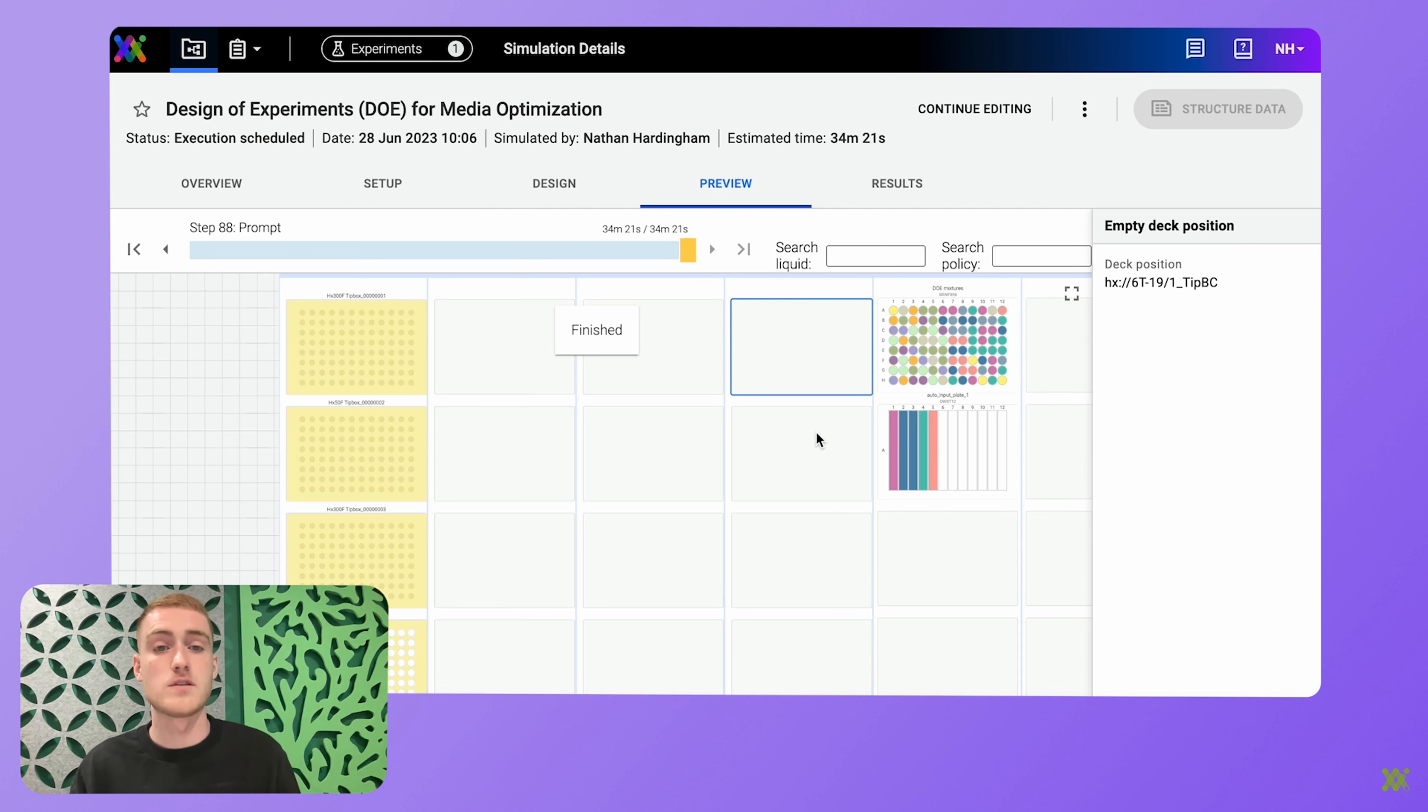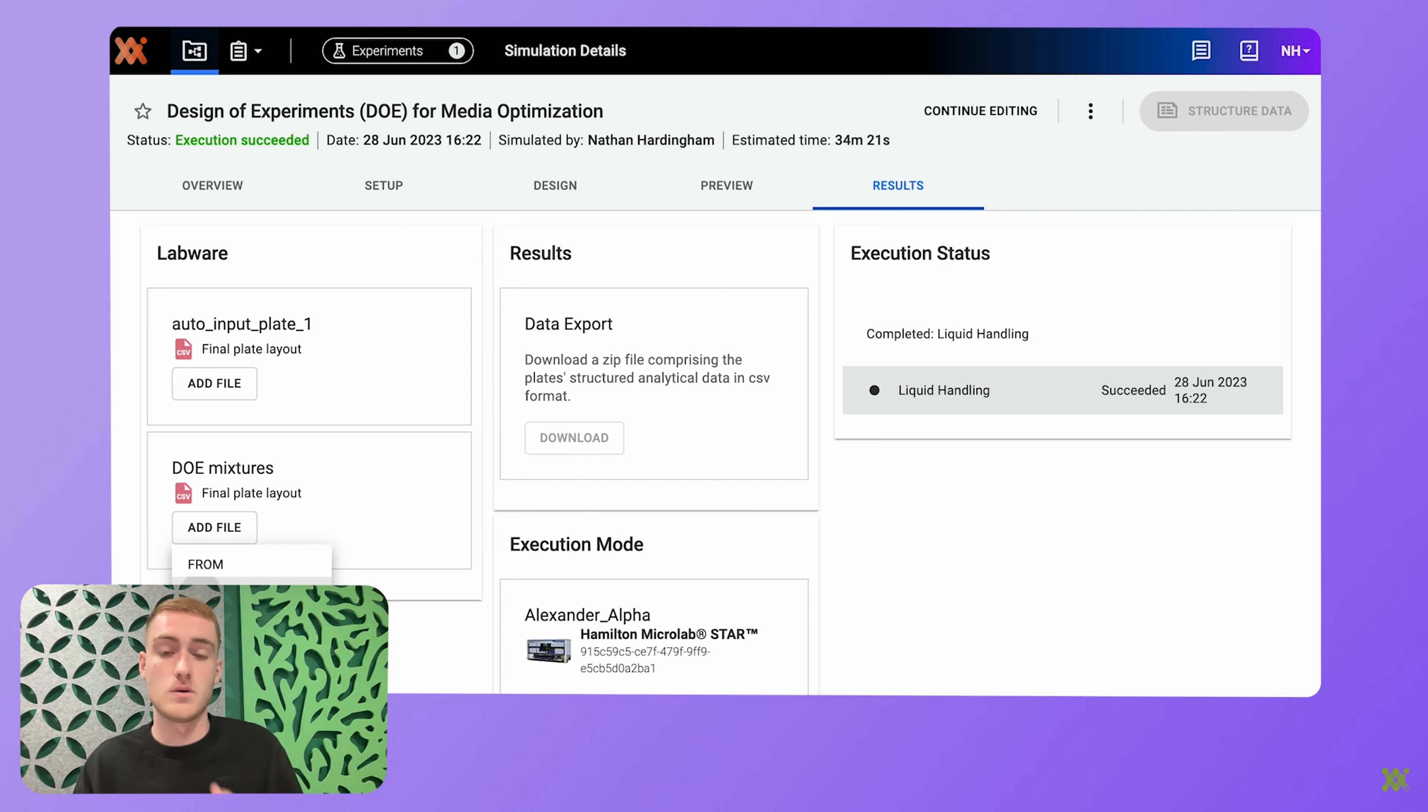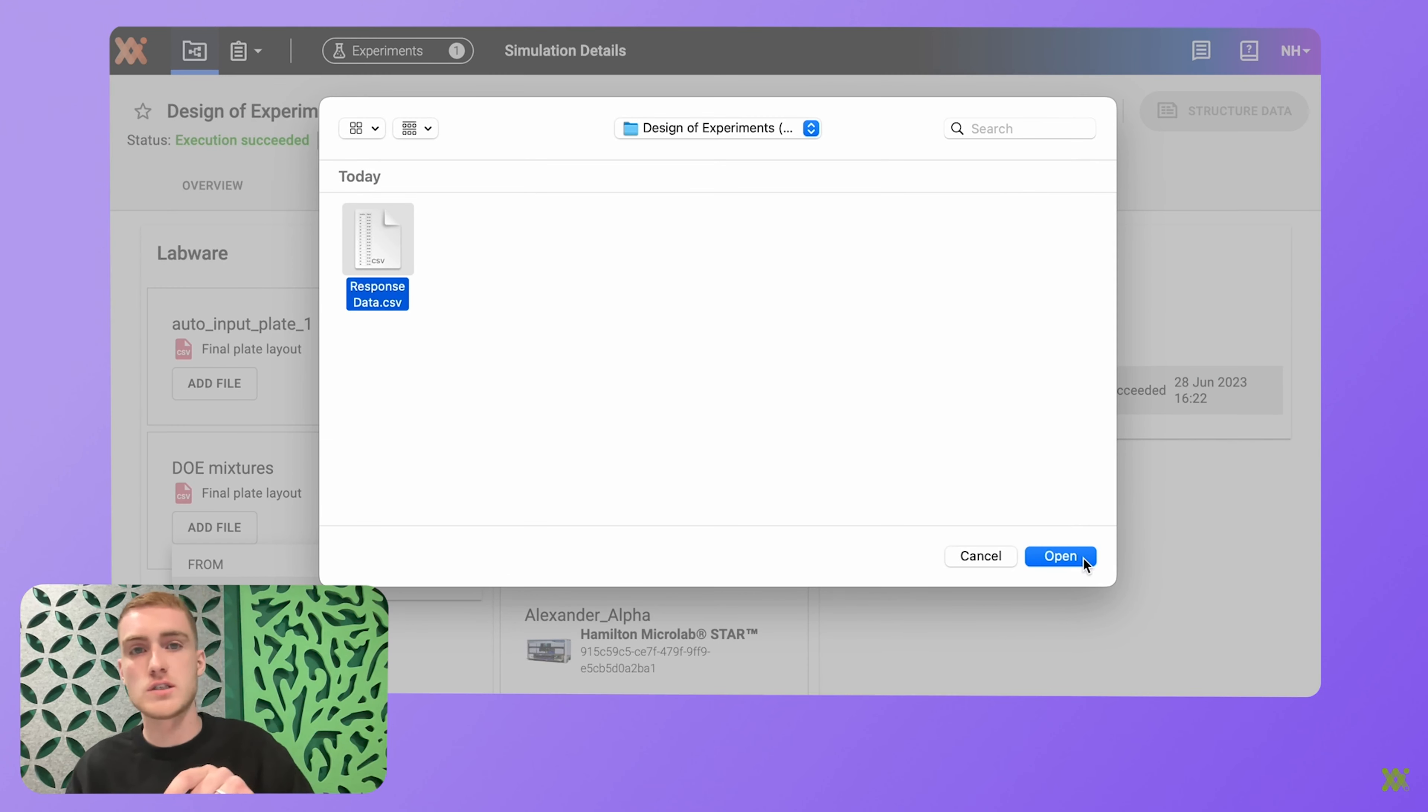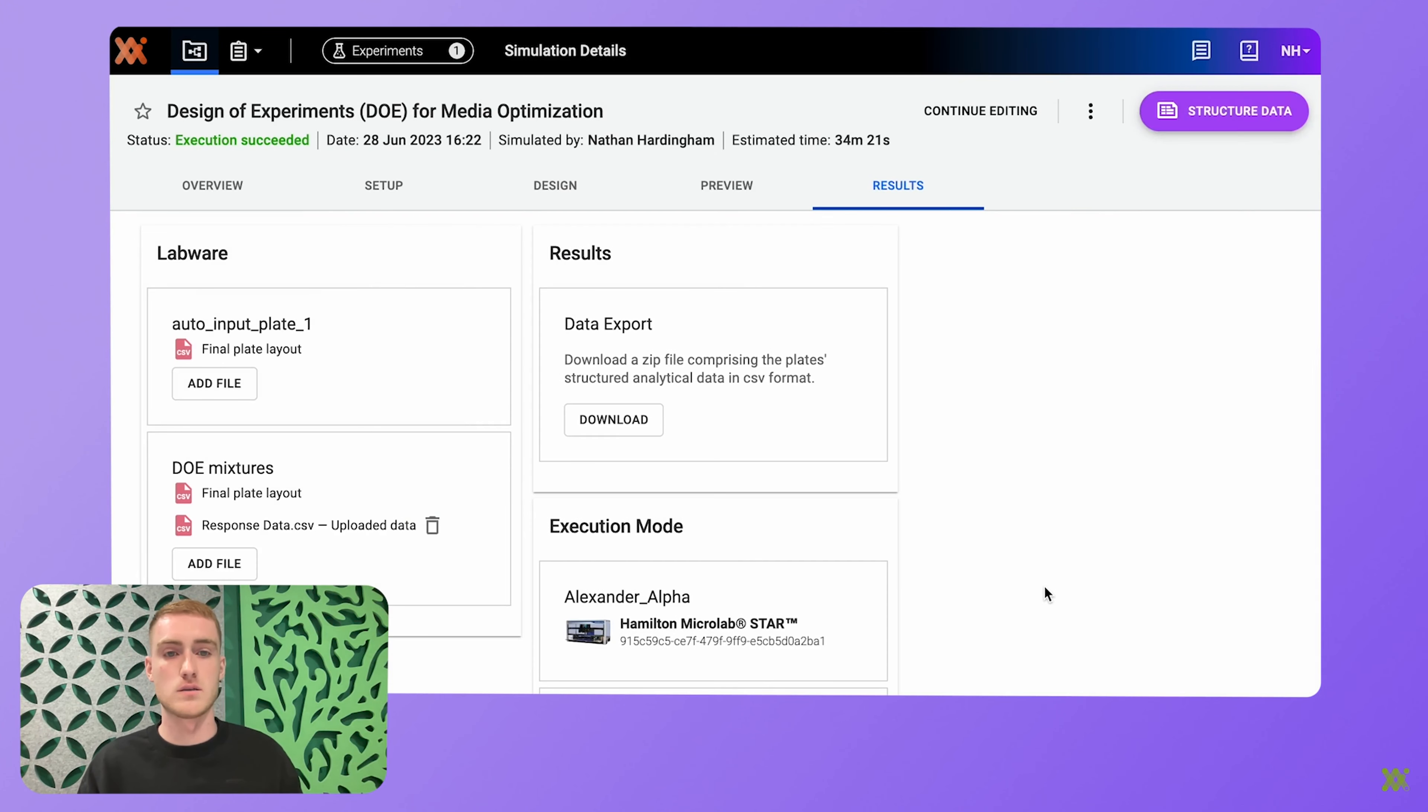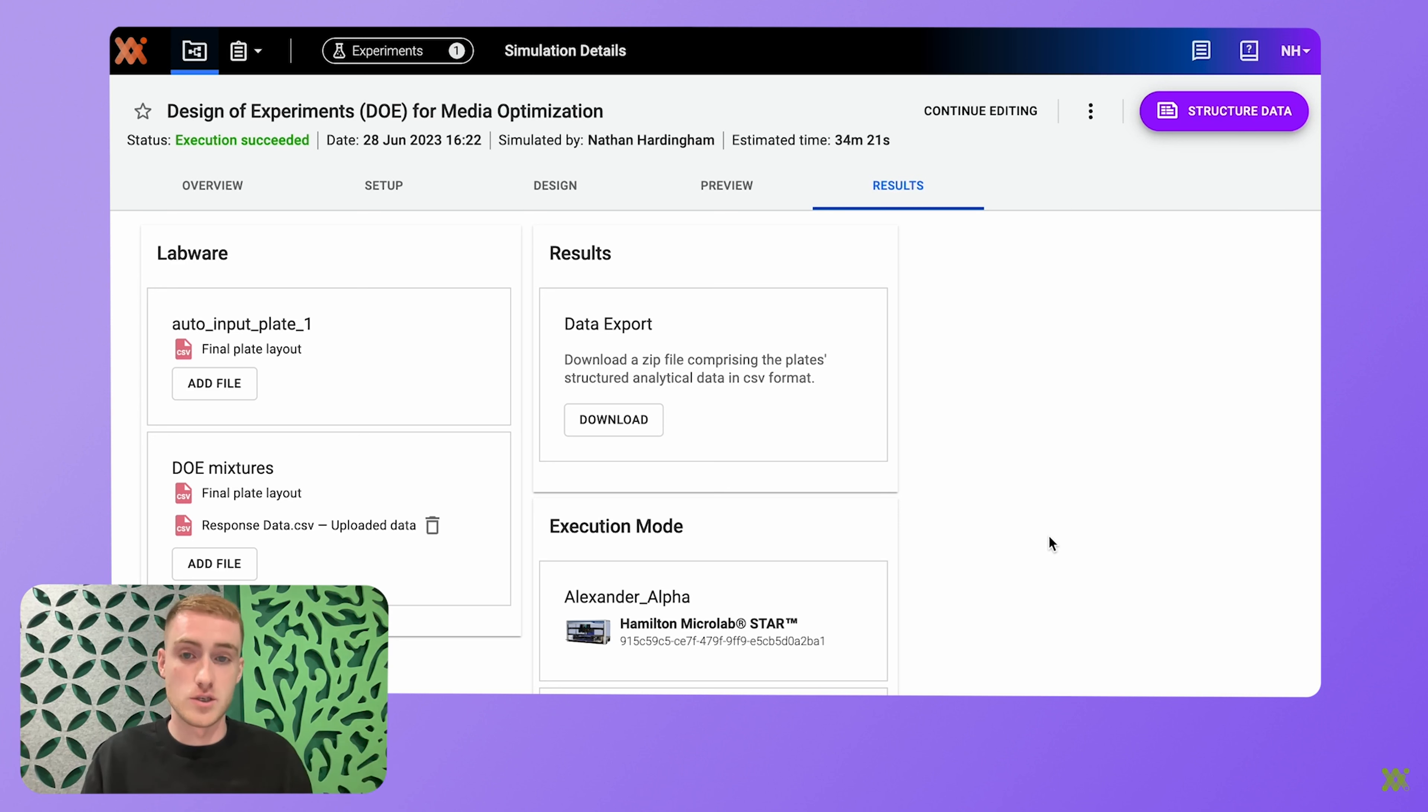Once that experiment's finished, you can then upload the data or, depending on your equipment, have that data automatically uploaded, not just to Synthase, but to the experiment you've been working on. And it's worth mentioning at this point, with Synthase, you're able to align data from multiple file formats and multiple executions.